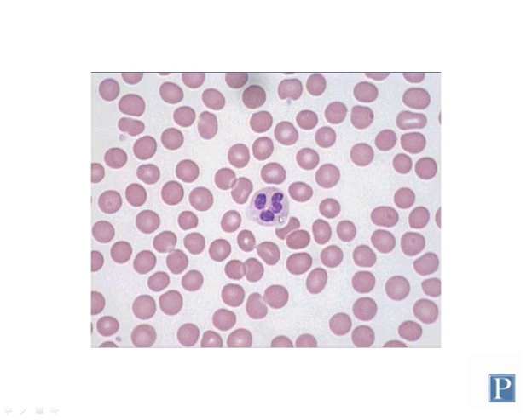So this white blood cell in the center of the slide here is called a neutrophil. Neutrophils are the most common type of leukocyte. They get their name because the cytoplasm has neither greater affinity for basic or the acidic dyes, so chemically they are neutral and stain just very pale, neither eosinophilic or basophilic.